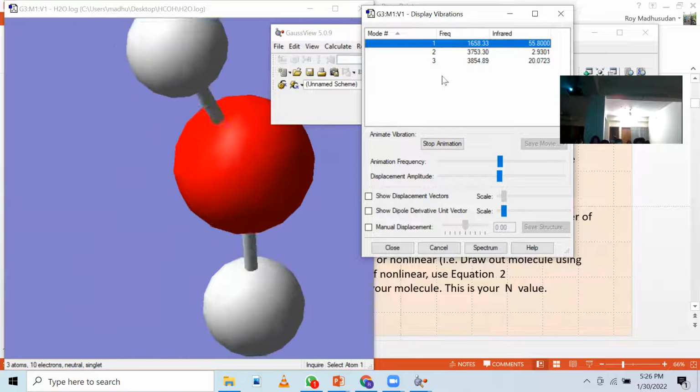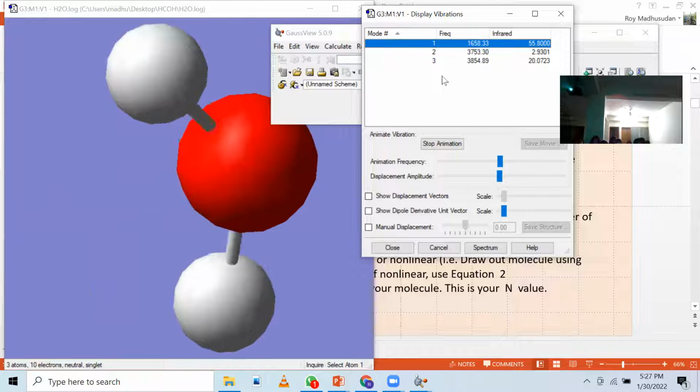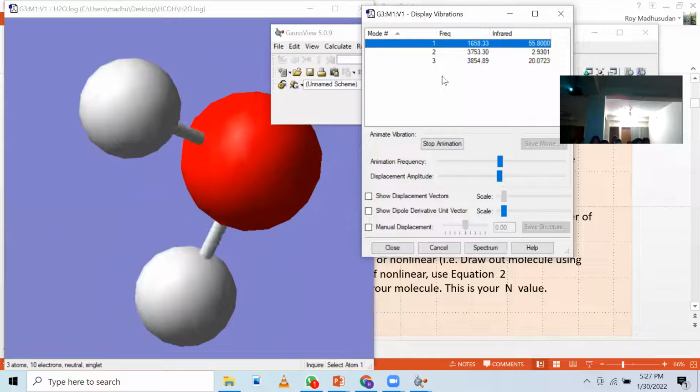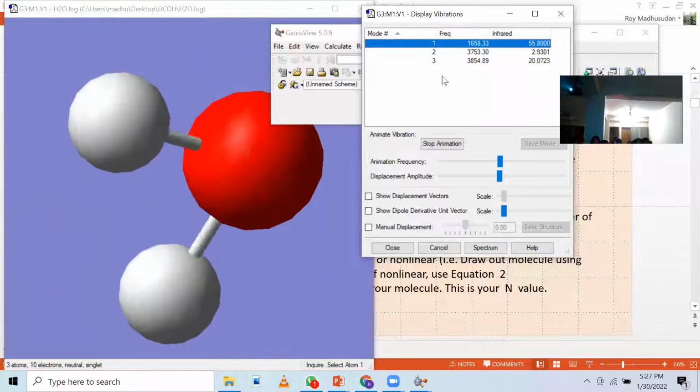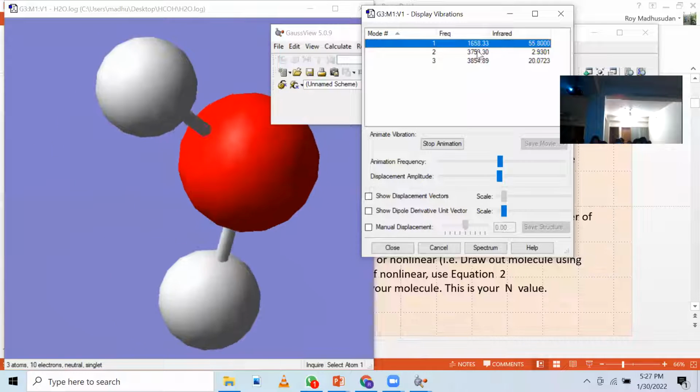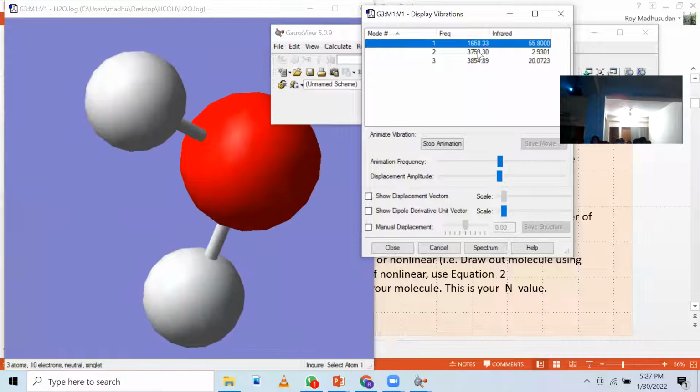So if we consider a water molecule, it will absorb in the fingerprint region below this absorption. No other molecule in the universe will absorb exactly like this water molecule. So it will help. That means this is our fingerprint region. And what types of infrared spectra we will find, I will show you later.